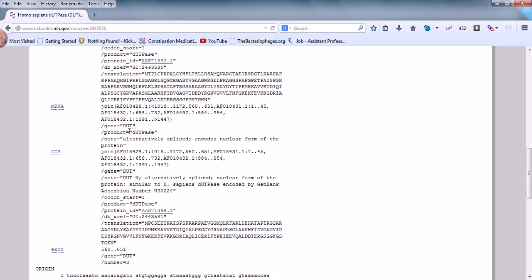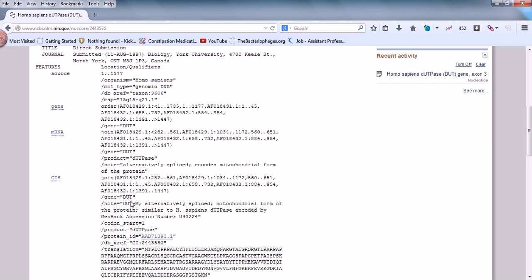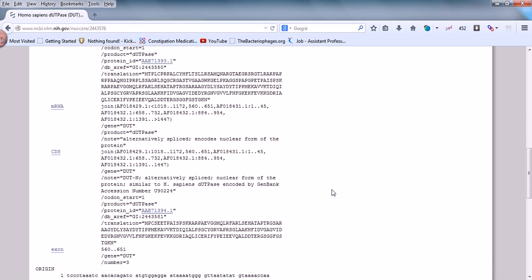As you can see here, the note says 'DUT.n' — where N means nuclear — indicating the alternatively spliced nuclear form of the protein, similar to dUTPase, with a GenBank accession number provided. The second mRNA entry is labeled 'DUT.m' — where M means mitochondrial — indicating the alternatively spliced mitochondrial form of the protein, also with a GenBank accession number. So DUT.m means mitochondrial gene and DUT.n means nuclear gene, both being results of alternative splicing.